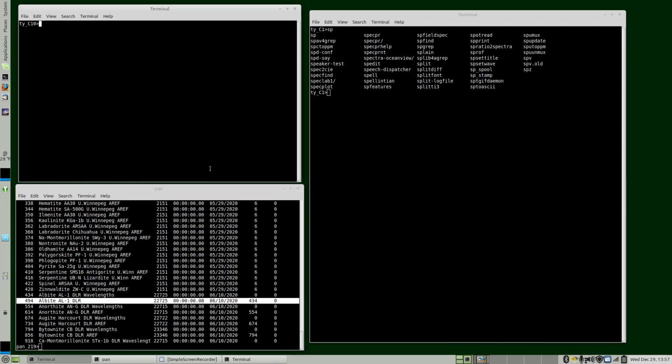So with that, let's start SpecPR. I've set up a directory here, and normally you type SpecPR or dSpecPR as the developmental version that may have some new features. Currently on this laptop that I'm running on, there's no difference. A restart file name, if you have a restart file, which I don't, then there's nothing in this directory.